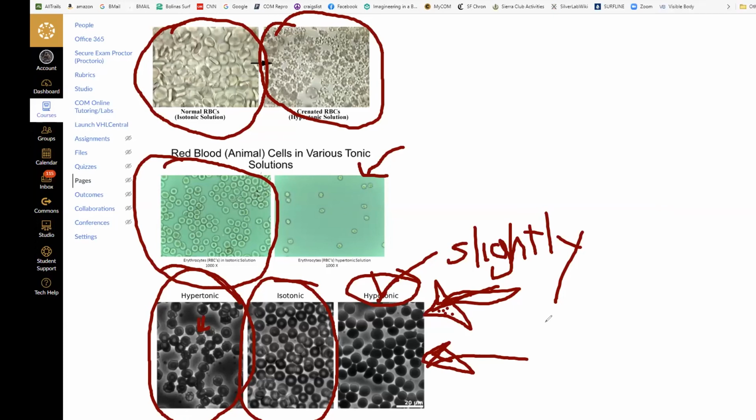Would glycerol fall into that one as well, or no? I would say, I don't know. That one's really not hitting a nice equilibrium. This is at least an equilibrium. I would say don't worry about the glycerol. If some of the glycerol has made it in, where they are depends on how long they've been sitting. So I would say you don't know. Gotcha, thank you.